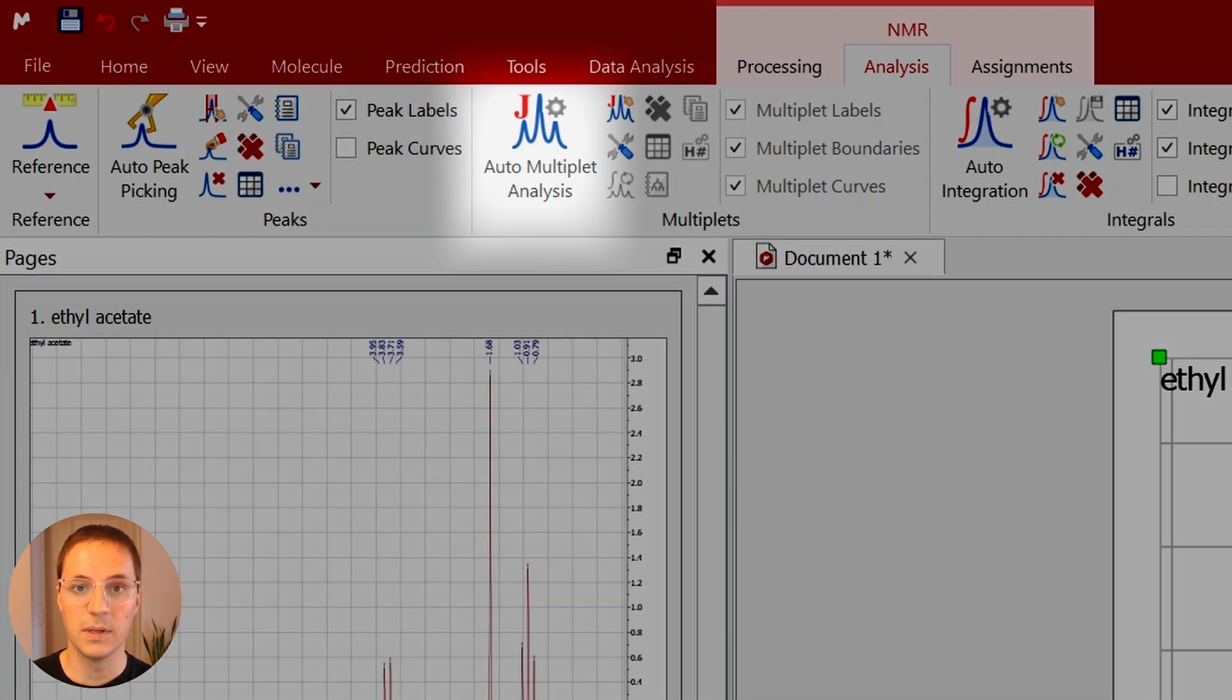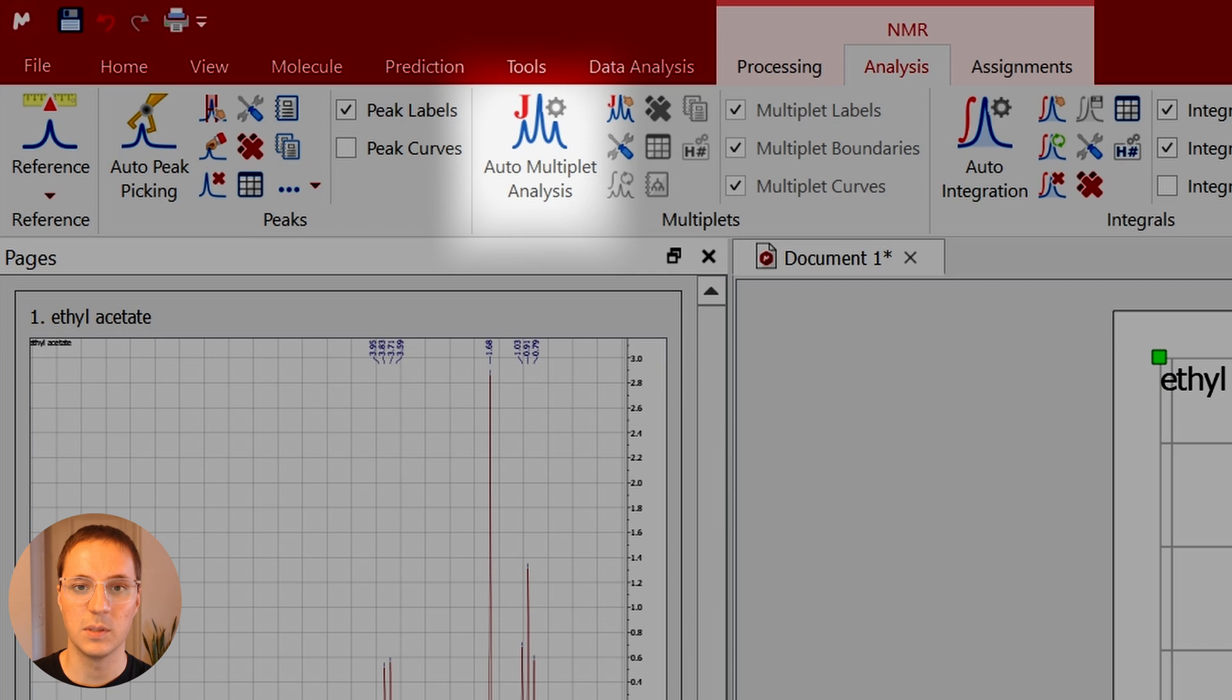The auto-multiplet analysis does both peak picking and integration at once and it also tries to label what kind of multiplet each signal is. Only use this function if you're confident in your multiplet assignments.